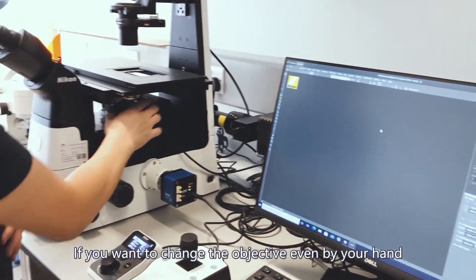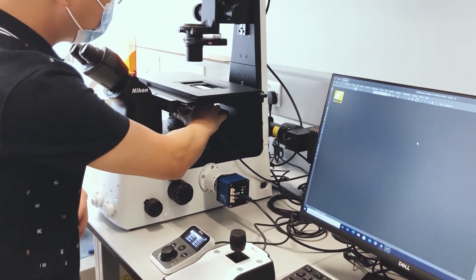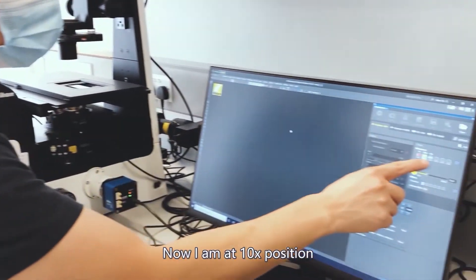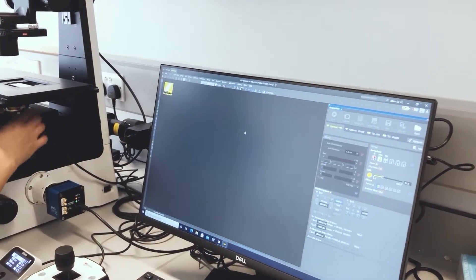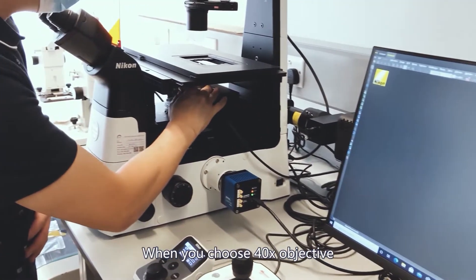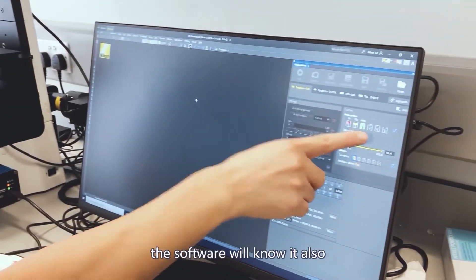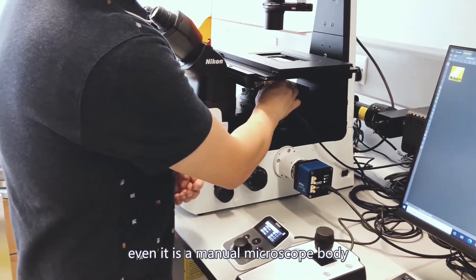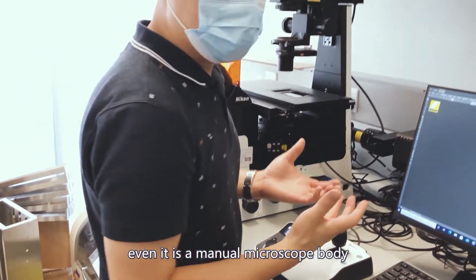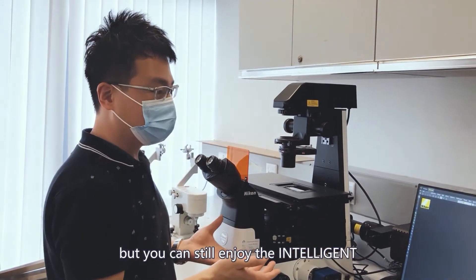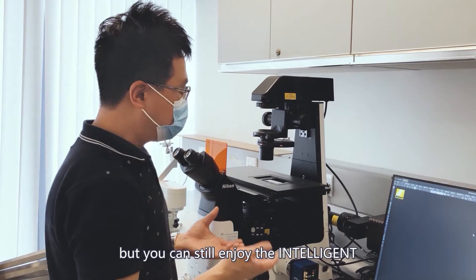And if you want to change the objective by your hand, for example now I'm at the 10x position, when you choose 40x objective, the software will know it also. Even though the microscope body is a manual microscope, you can still enjoy the intelligence.